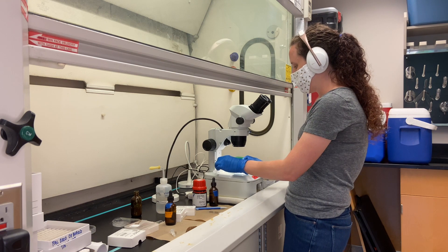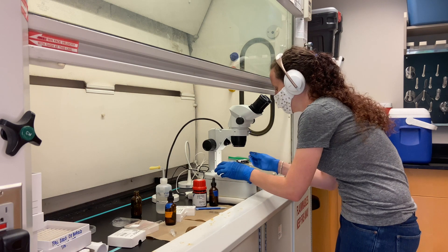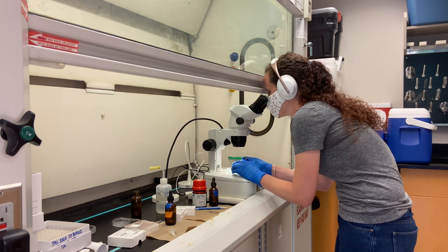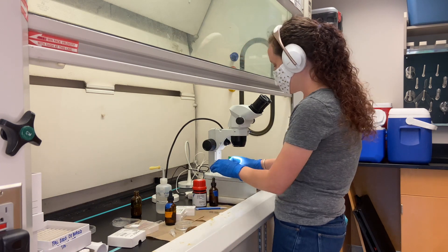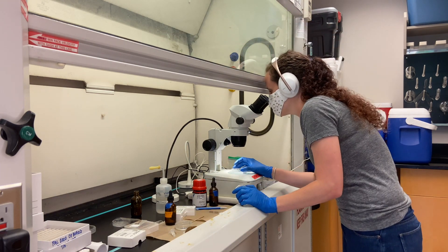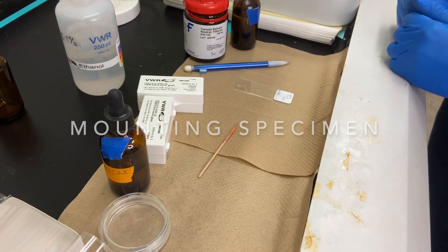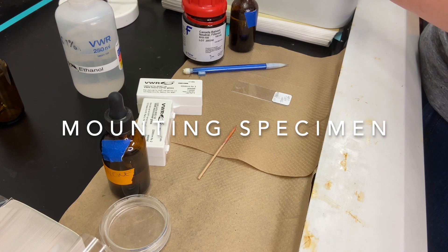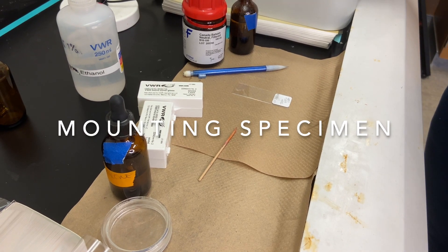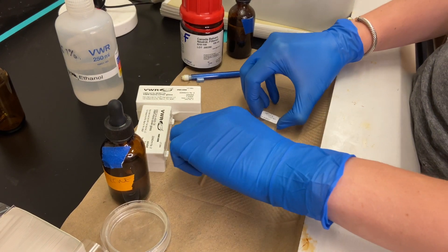I'll move the specimens from the ethanol to the xylene — the petri dish is labeled just to make sure I don't mix them up. Once they're in the xylene, they usually clear right away — it's pretty immediate. Make sure you keep the xylene covered at all times because it evaporates very quickly and you don't want to dry out your specimens.